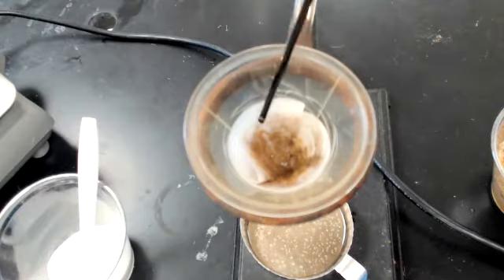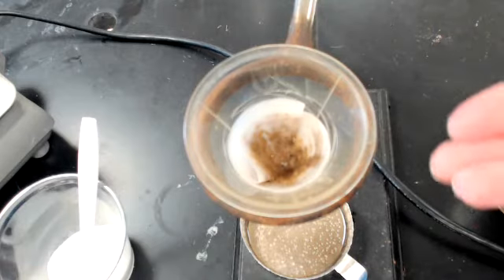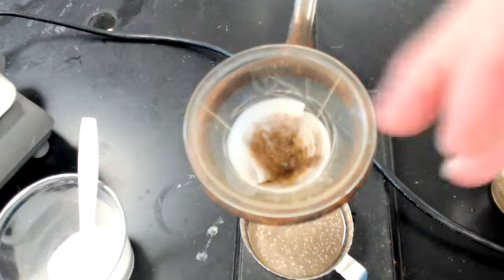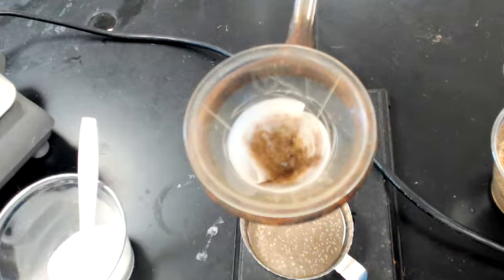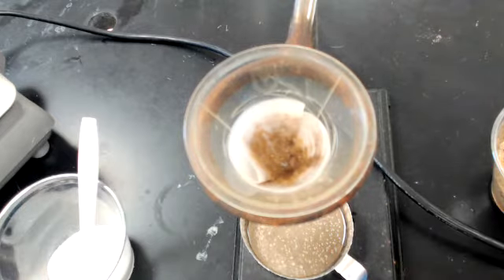So notice how it's not necessarily dry. I don't want to say it looks dry because it doesn't. It definitely looks like there's still water on the filter and in the sand, but there's no puddles of water. There's nothing that I would expect now to still go dripping through that filter.